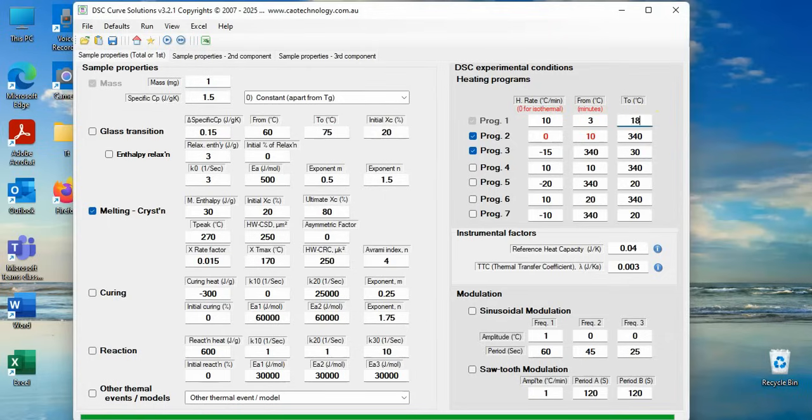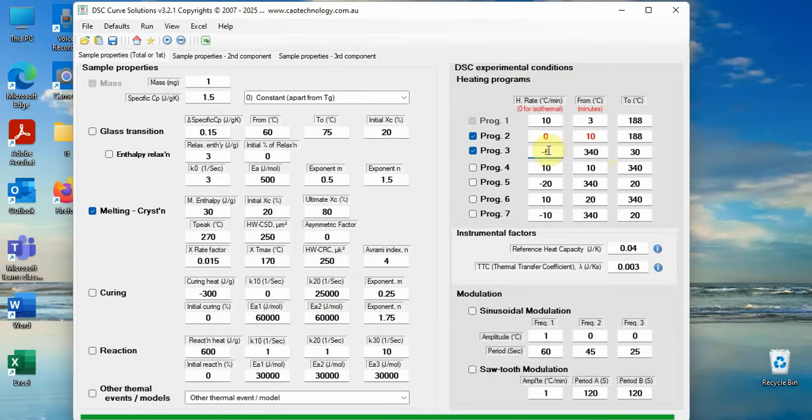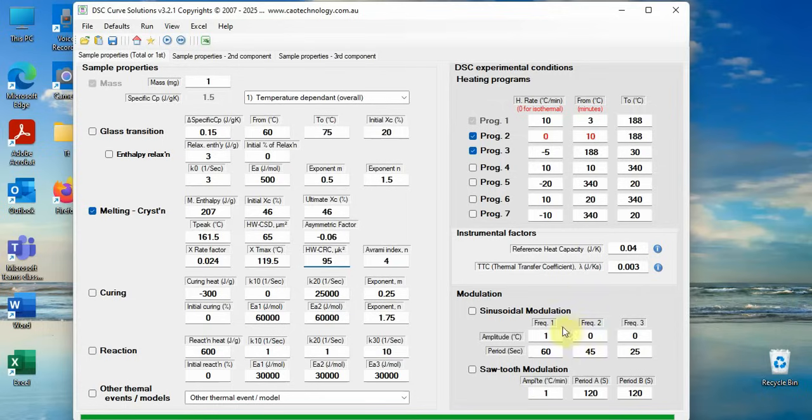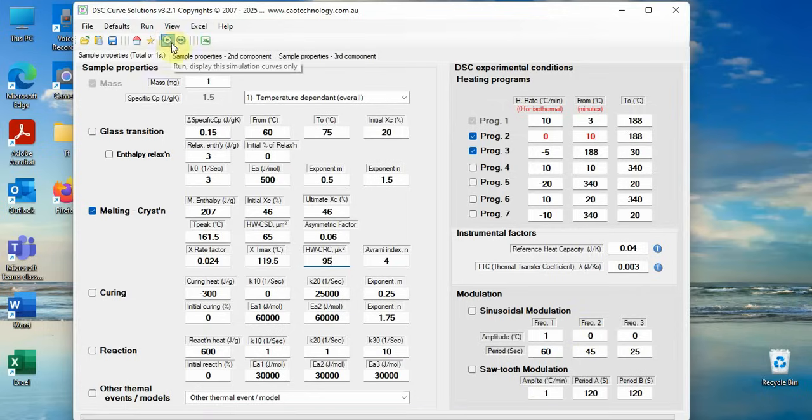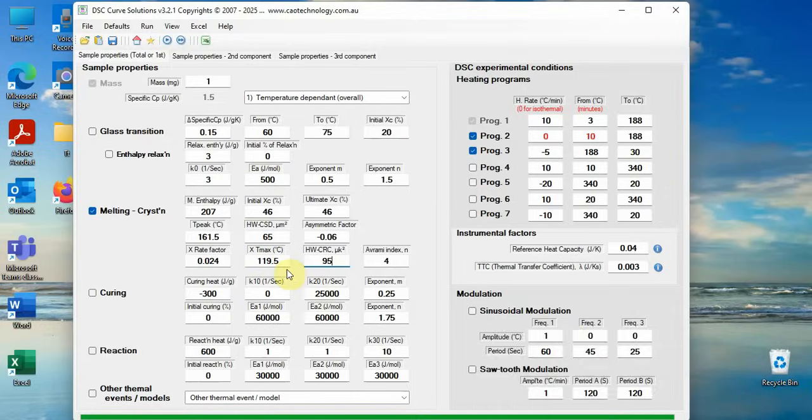Trials and errors until simulated curve matches the experiment curve. All the crystallization and melting parameters determined.